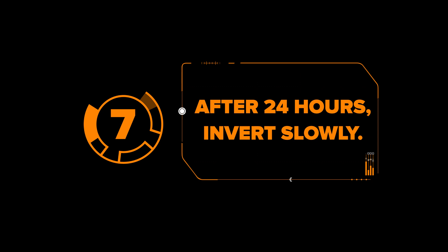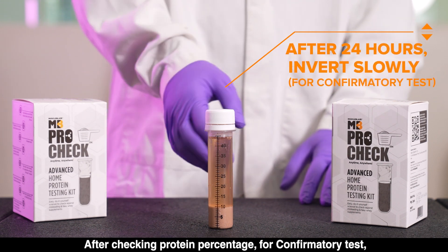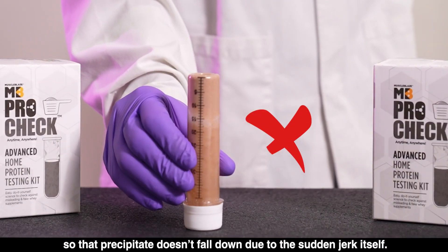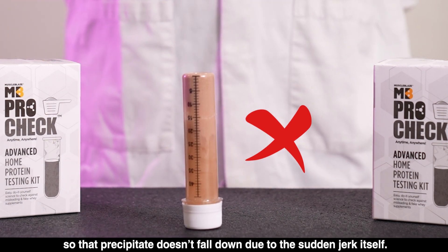Mistake 7: After 24 hours, invert the tube slowly. After checking the protein percentage for the confirmatory test, inversion of the tube should be done slowly and steadily so that the precipitate doesn't fall down due to a sudden jerk.